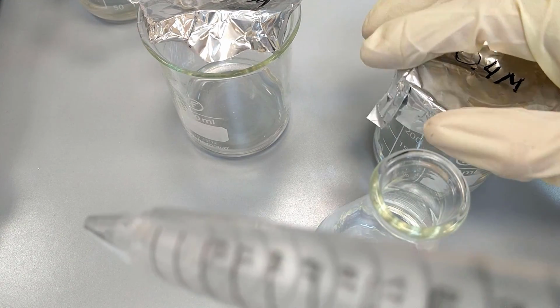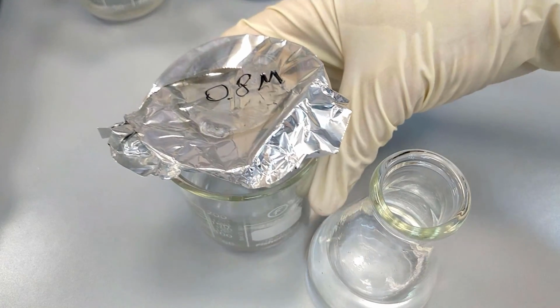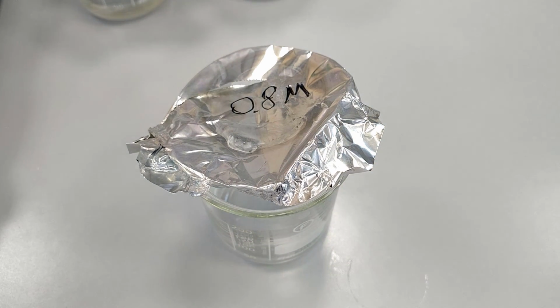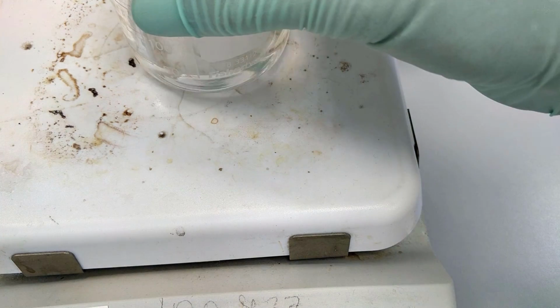After pipetting it up and down, we switch to the magnetic stirrer. So 0.4 concentration is ready. So we place the magnetic bean inside the solution of 0.8 molar concentration and place it on the stirrer.